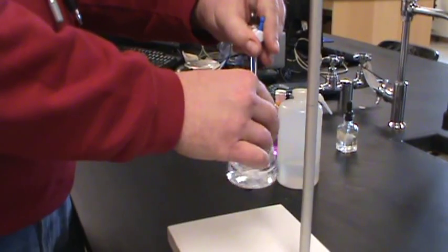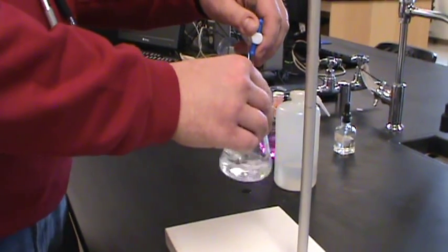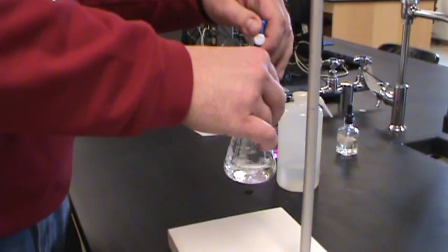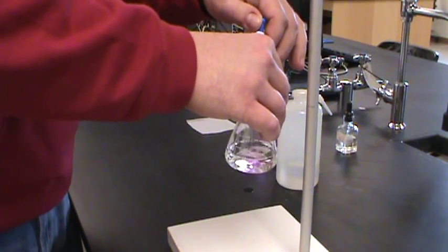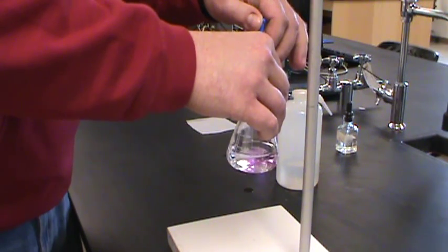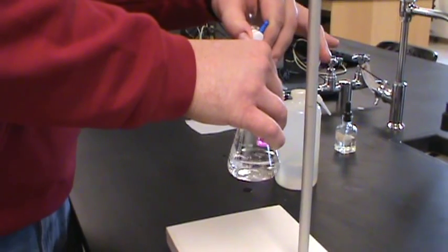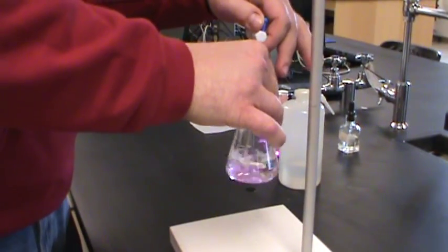Now at the beginning I can add pretty fast because I know I've got quite a ways to go. But one thing you'll notice, if I stop swirling it for a minute, the middle of the solution actually is turning pink as the titrant is being added. But if I give it a swirl, it all goes away. So every once in a while, it's a good idea to stop, give it a swirl, make sure all the color is disappearing. But most of the time, you can just keep right on rolling.